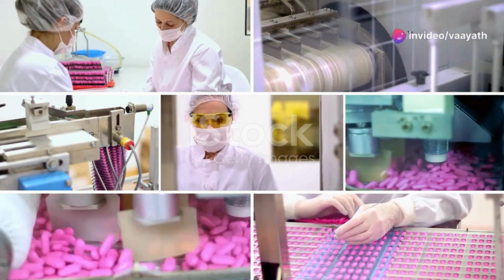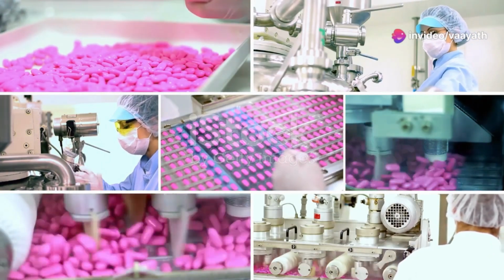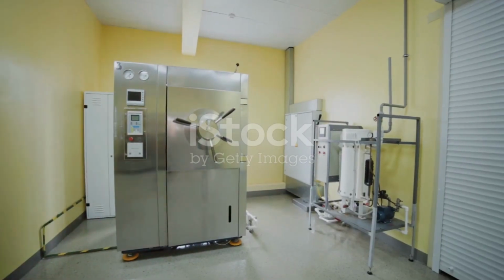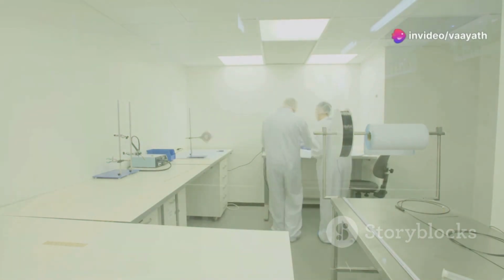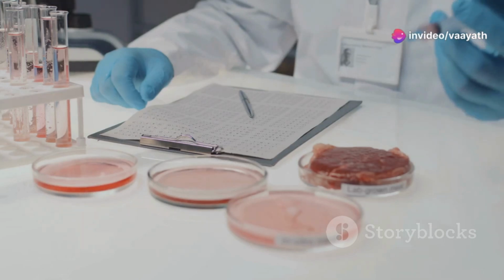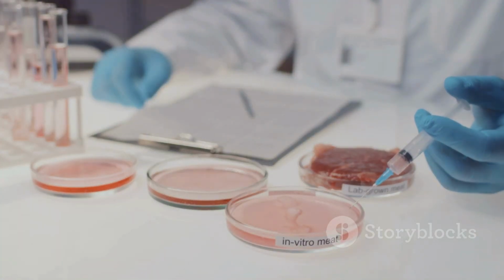Media fill validation is a resource-intensive process, requiring specialized equipment, materials, and trained personnel. Key equipment includes autoclaves for sterilization, laminar flow hoods to provide a sterile working environment, and incubators to grow any potential microbes. The culture media itself is a critical component, carefully selected to support the growth of a wide range of microbes.